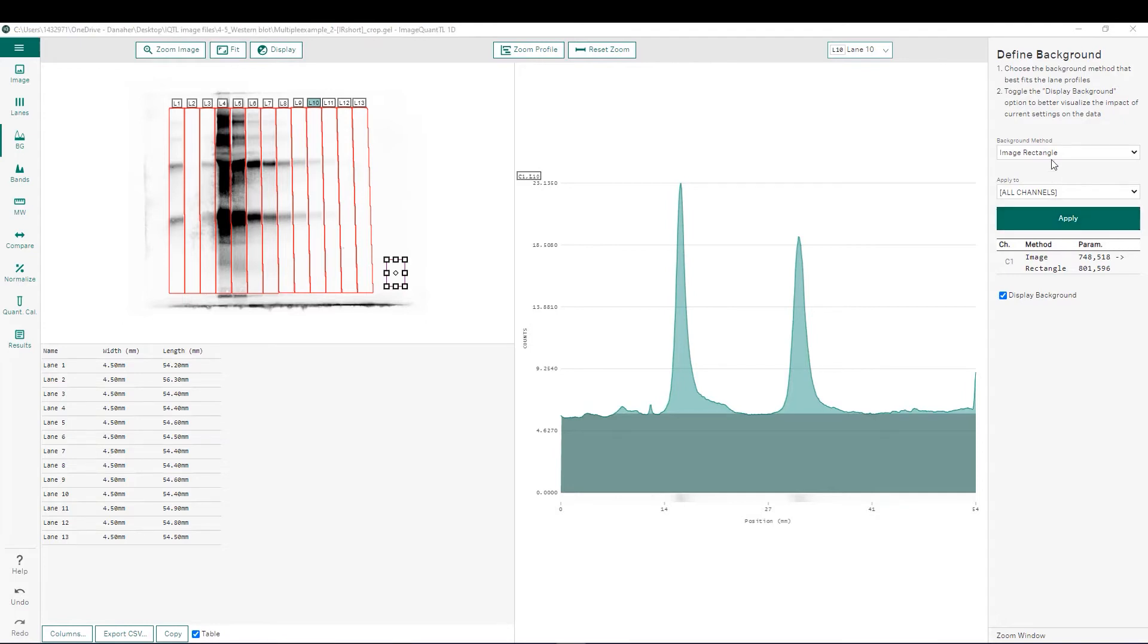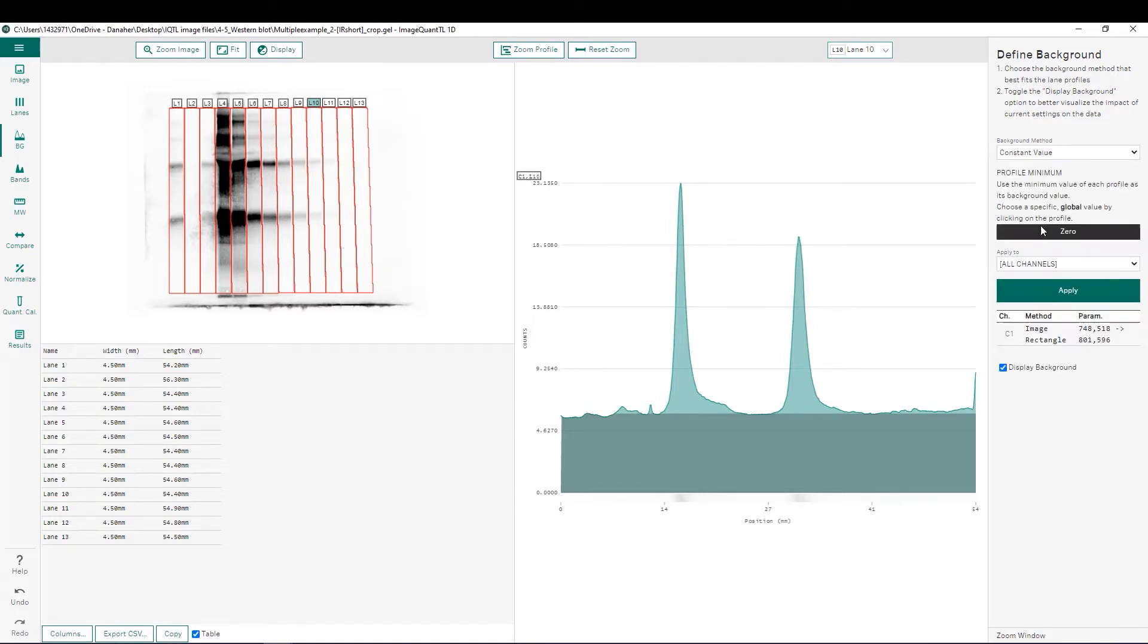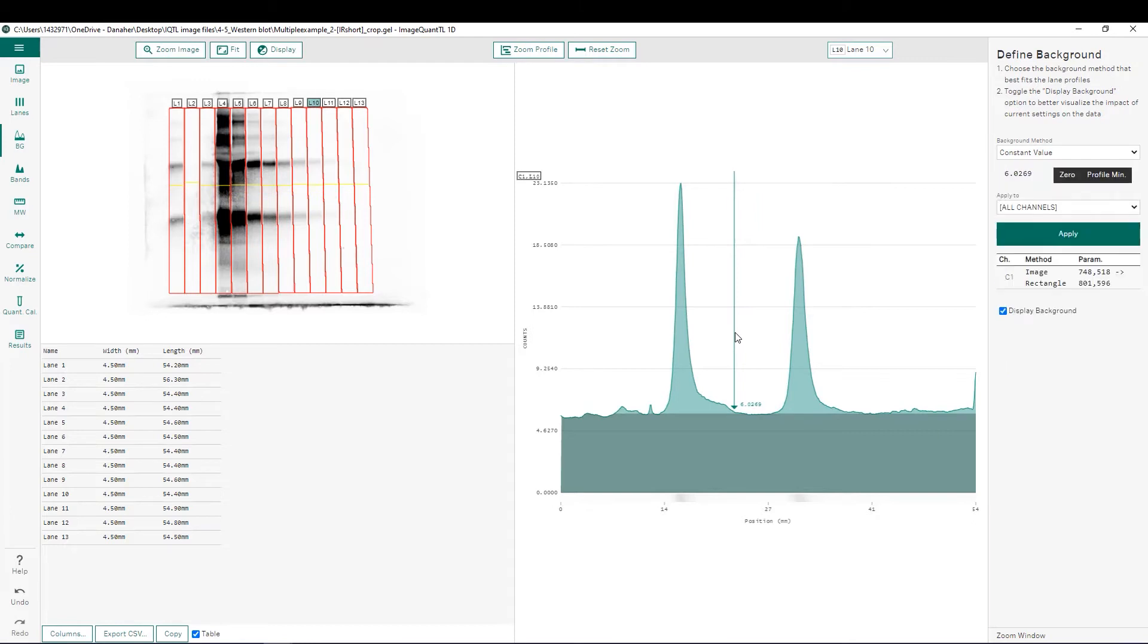The next background subtraction method we're going to look at is constant value, which can be treated both as a global background subtraction as before or also as a localized background subtraction for each individual lane. To use it as a global subtraction, simply move along the intensity profile until you find a background level that you'd like to take away from every pixel on the image. Simply click apply and it will utilize that background subtraction for every pixel on the image.